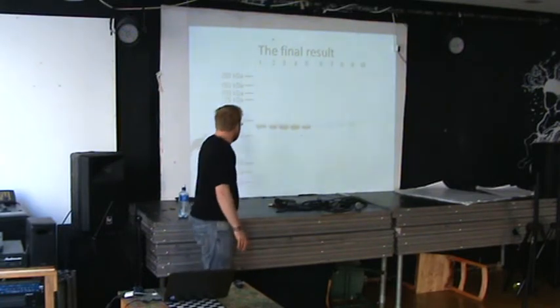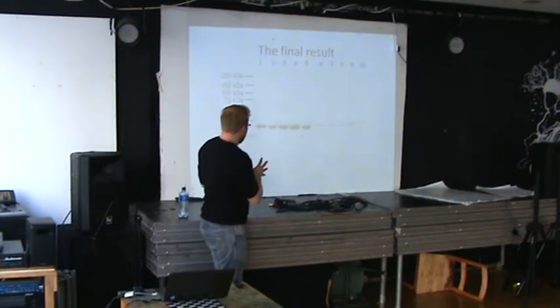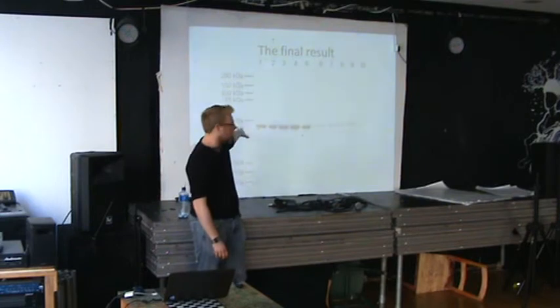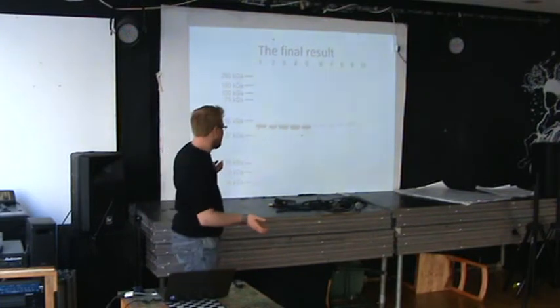So these are all the different sizes. This protein here is between 50 and 37. Then we took our antibody, put it on top, and it bound just to our protein. We have a fluorescent label on it, which we then activate, and then it will actually release light, and we capture that with a camera, just like the same principle of any photography.